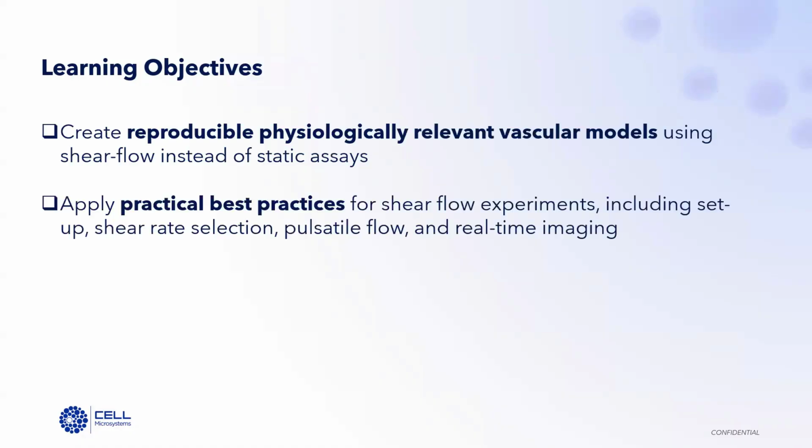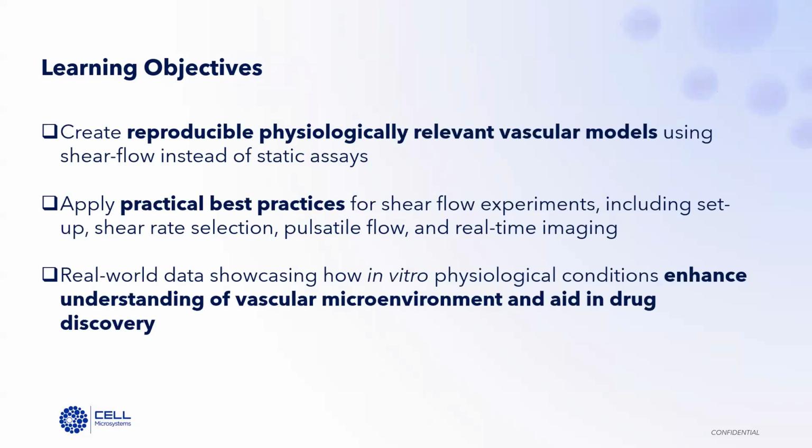You'll also learn how to apply practical best practices for shear flow experiments in terms of setup, shear rate selection, pulsatile flow, and real-time imaging. And we'll review real-world data showing how mimicking physiological conditions enhances our understanding of the vascular environment to support the development of more effective therapeutics. So let's get started.